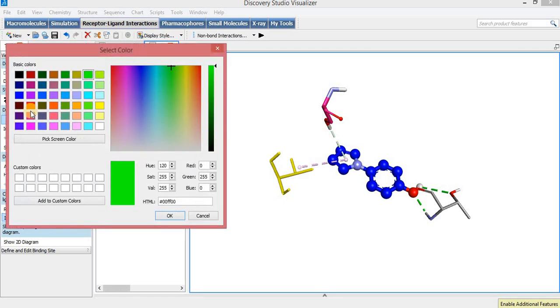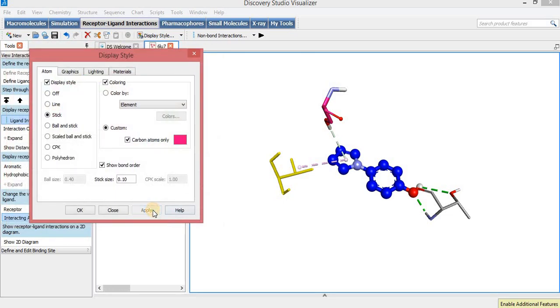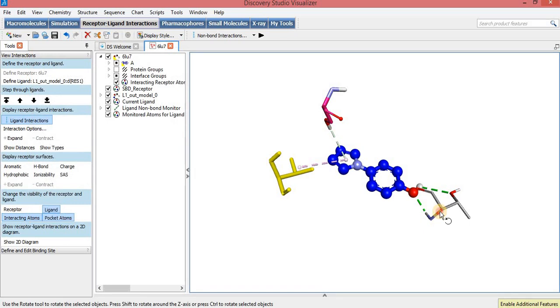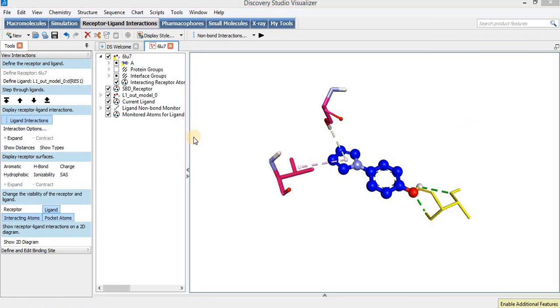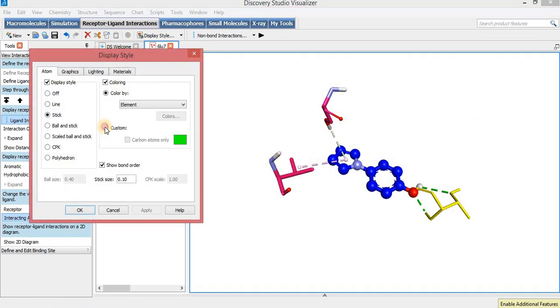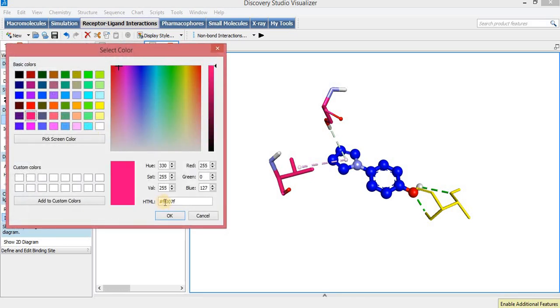I will change the color of the other amino acid residues one by one. Now it is the third amino acid residue, and I will also change the color of this amino acid residue in the same way.